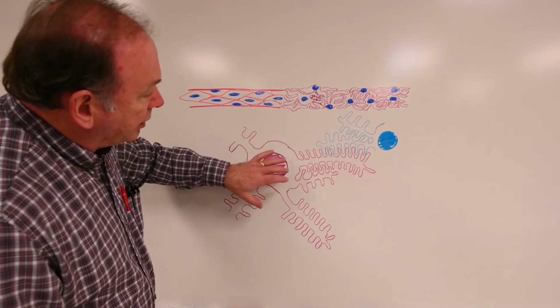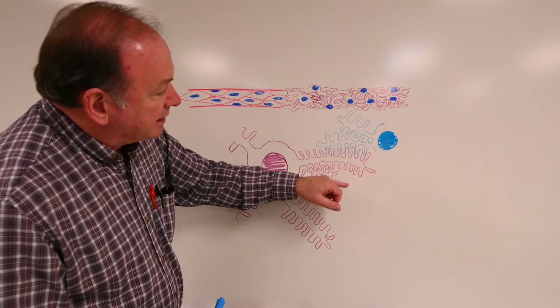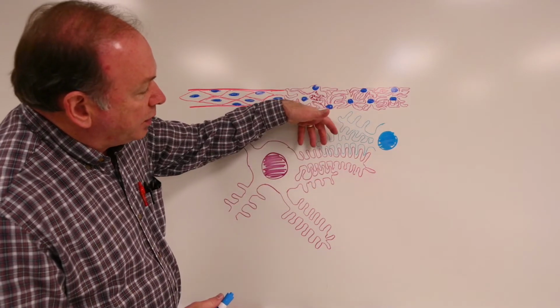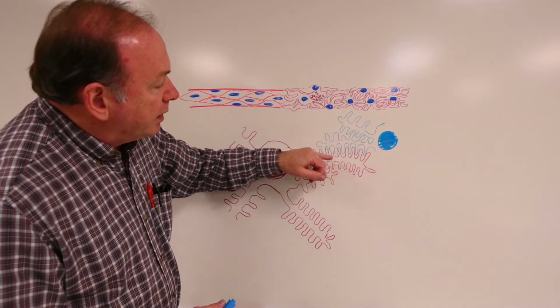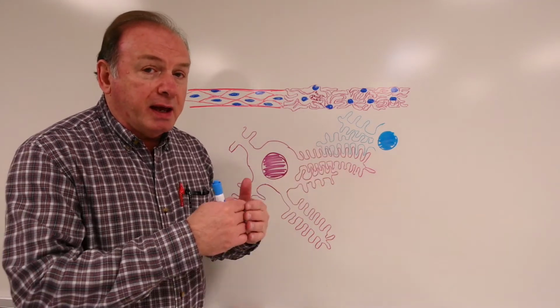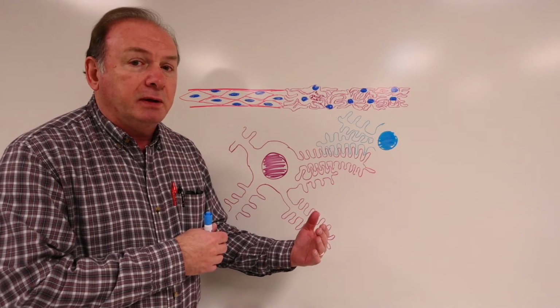And so here's one podocyte and it has arms, and on the arms that reach out we have these little extensions we call pedicels. These pedicels will interdigitate with pedicels from neighboring cells. So here's a neighboring podocyte and its processes and pedicels that interlock there.